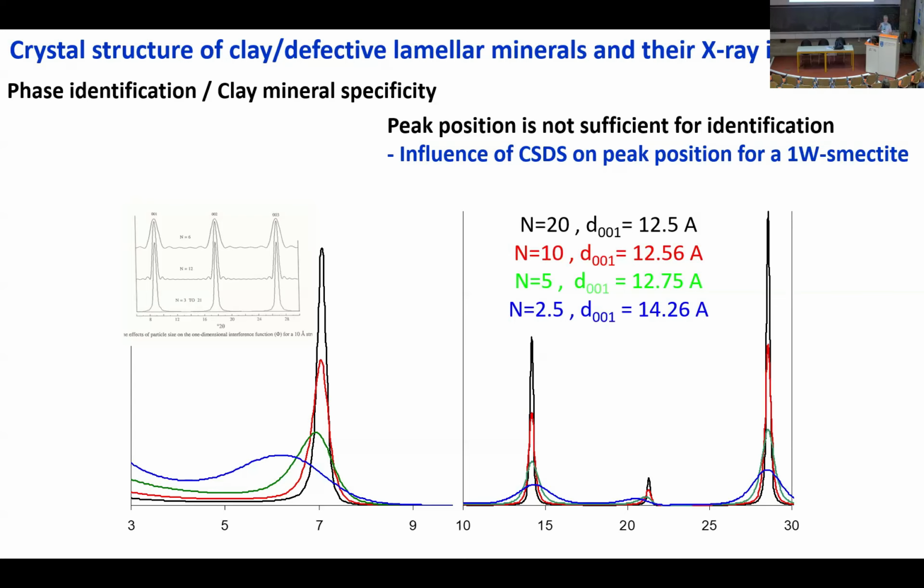So this is not to convince you that there is no way to deal with all this. If there was no way, I would not be here speaking with you. It's just to say that if we want to deal with X-ray diffraction identification of clay minerals, we have to be aware of these different possibilities, of these different factors that may influence or not the diffraction data we may obtain from the samples we have.